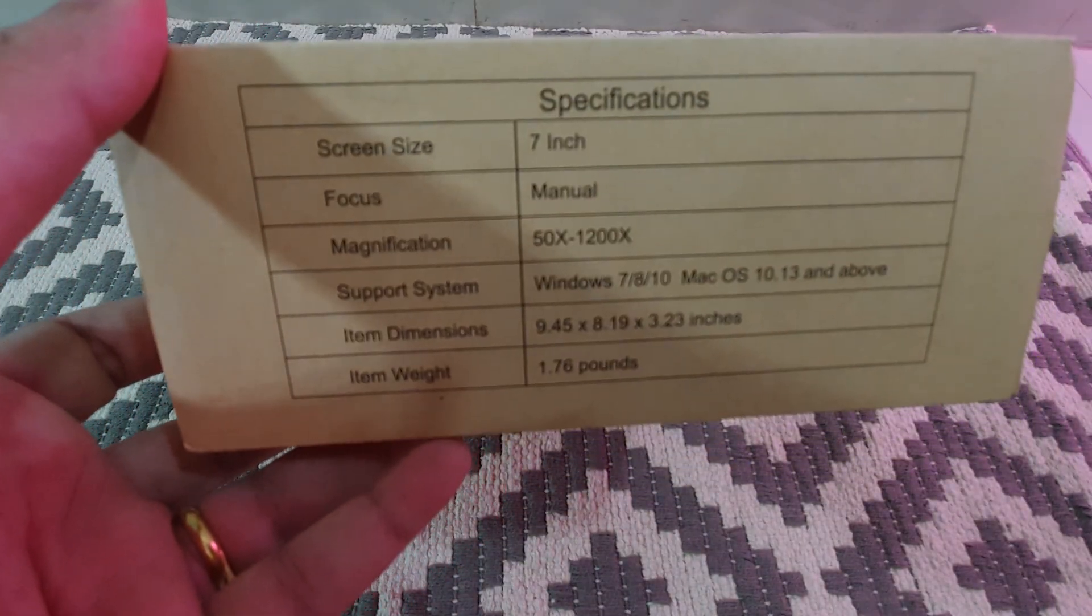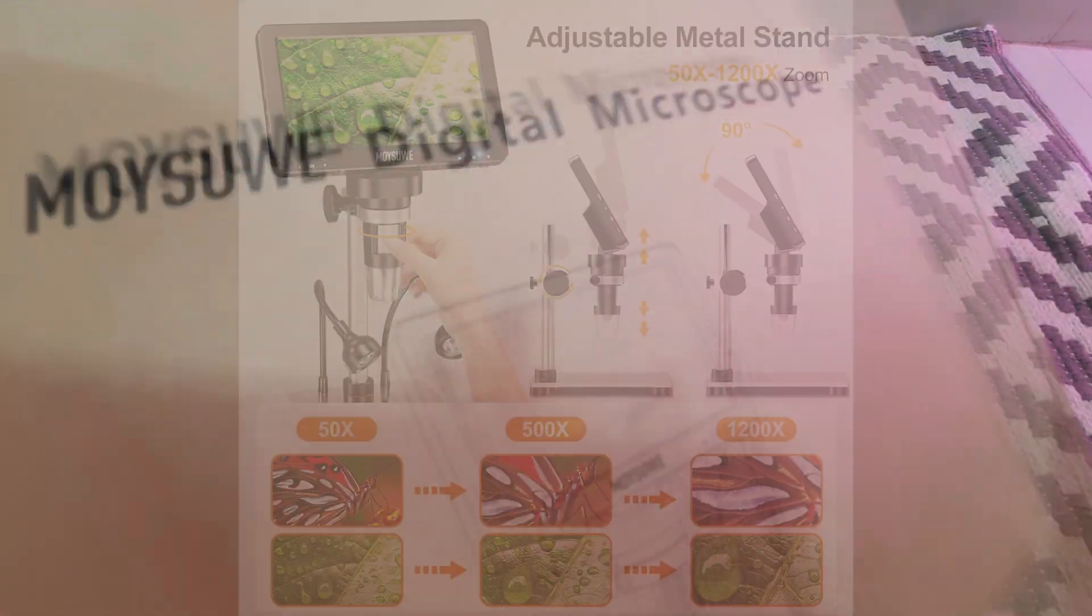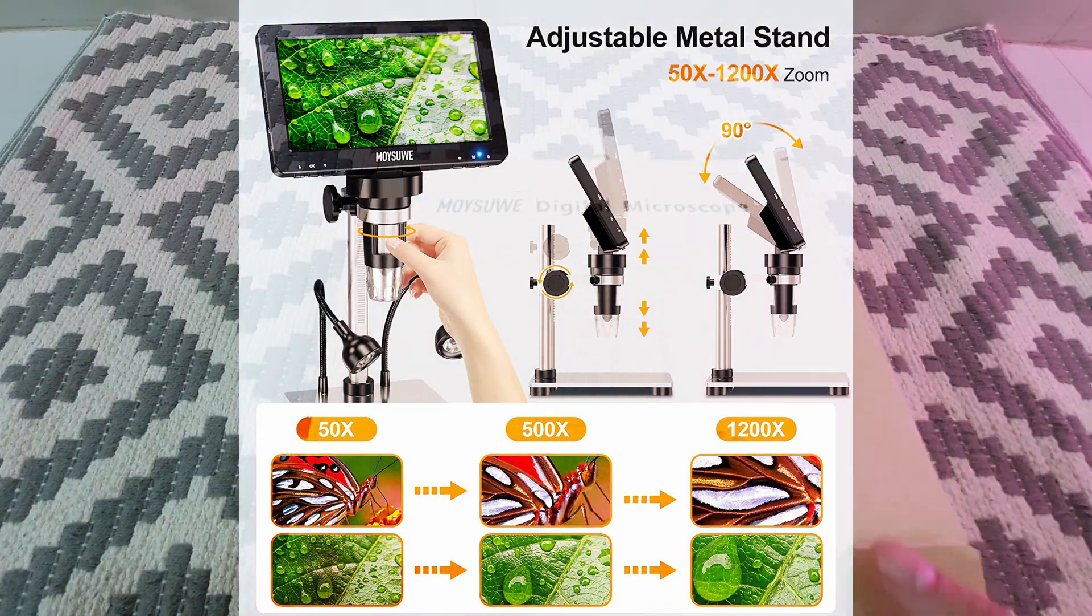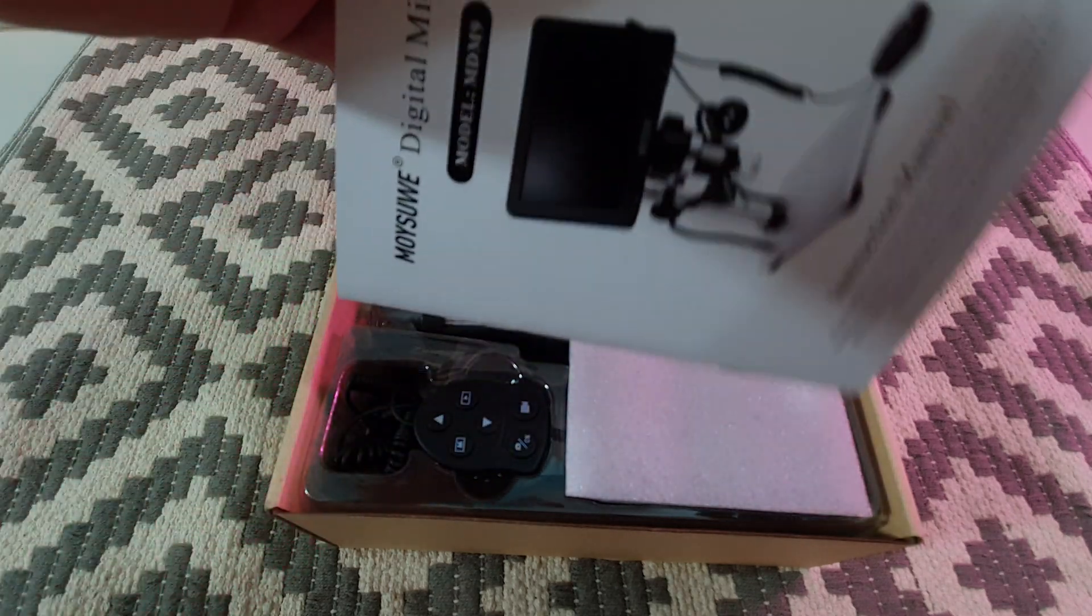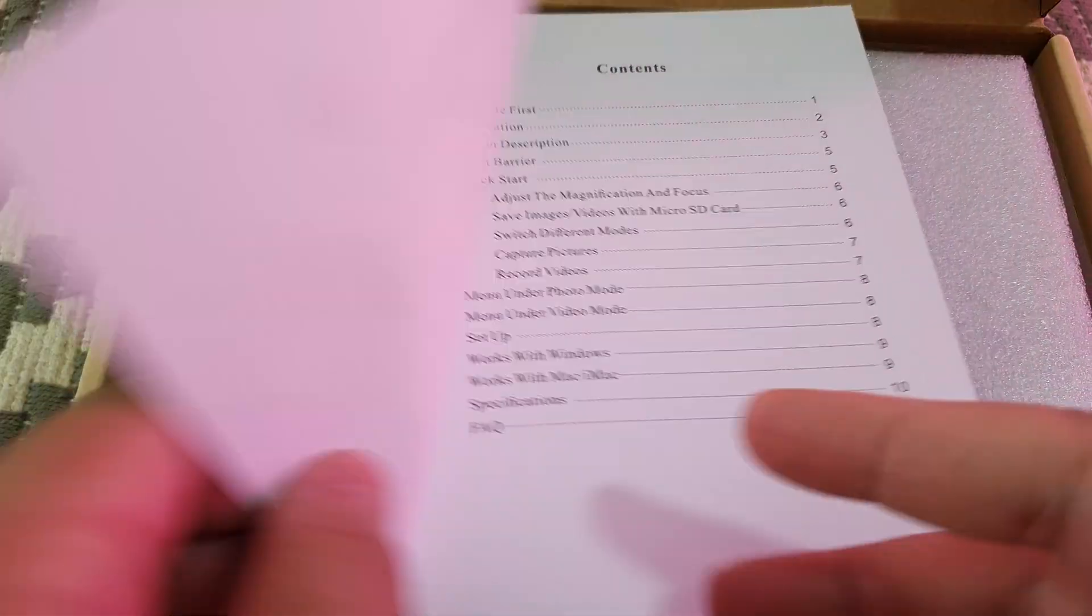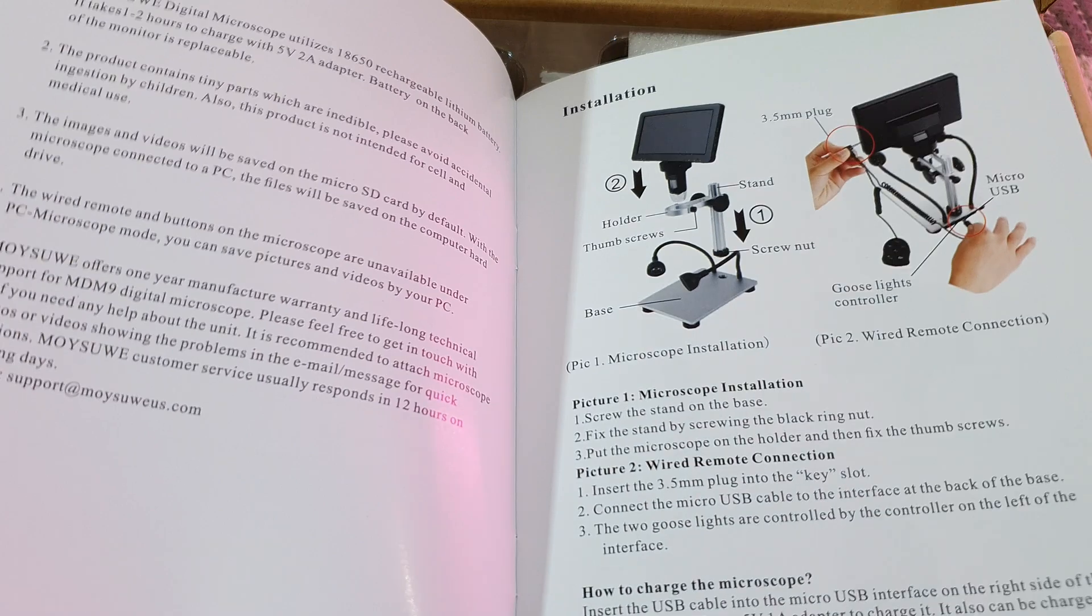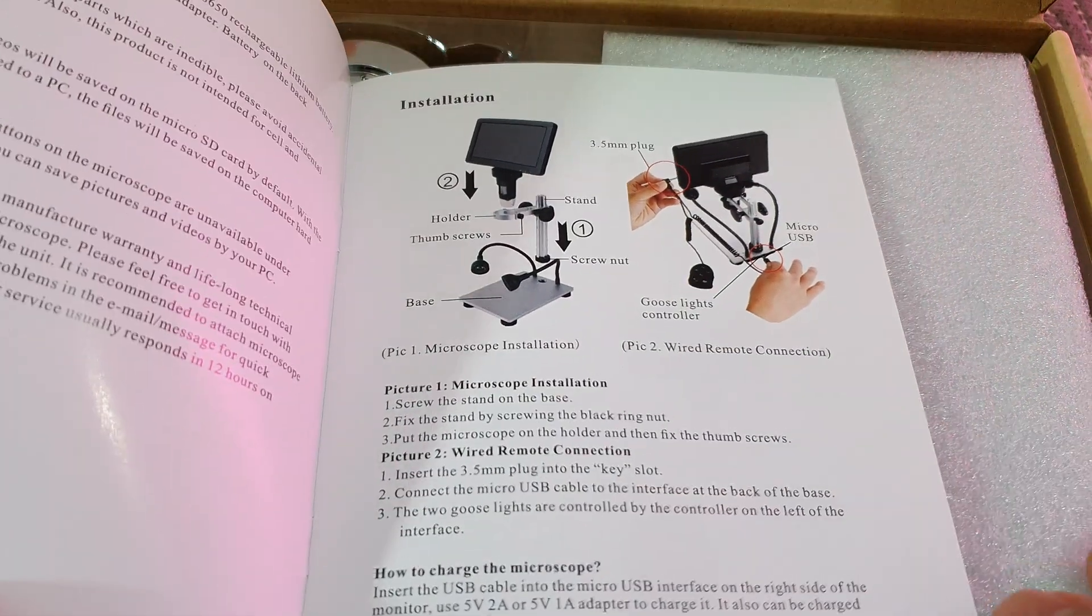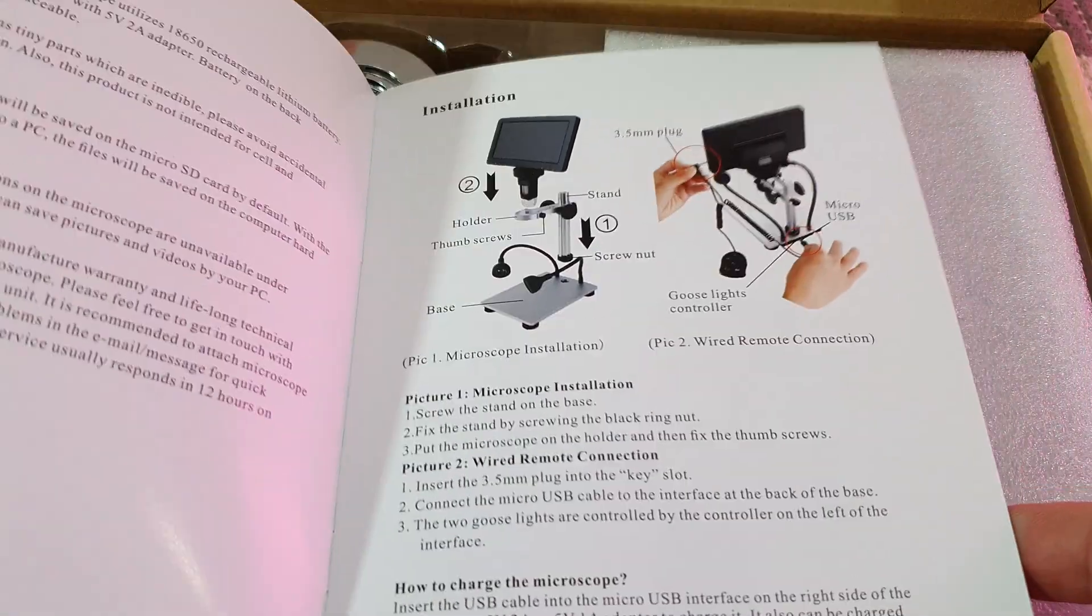Let's have this opened up. Inside you get a nice manual which is placed right at the top talking about how to fix this up. It's a pretty comprehensive user manual with a lot of things mentioned inside and color photos too, which is really nice to see. The English isn't too bad. This looks like it can really help you set this up.